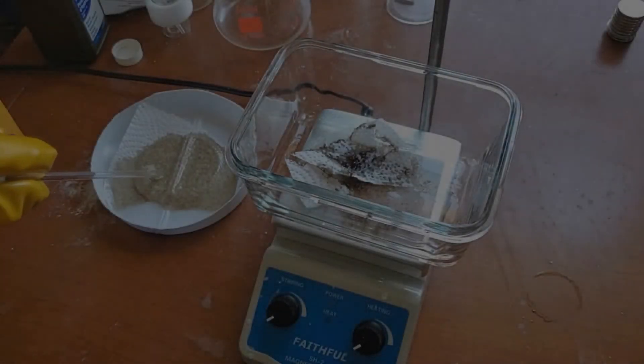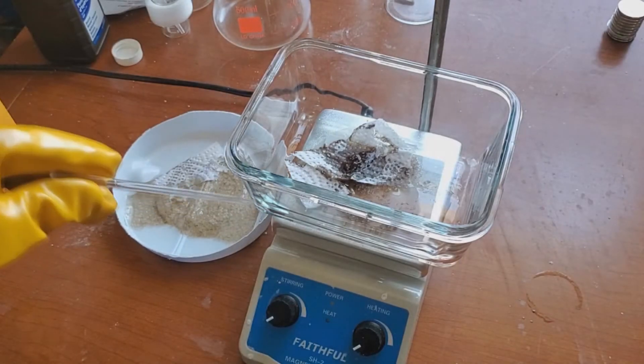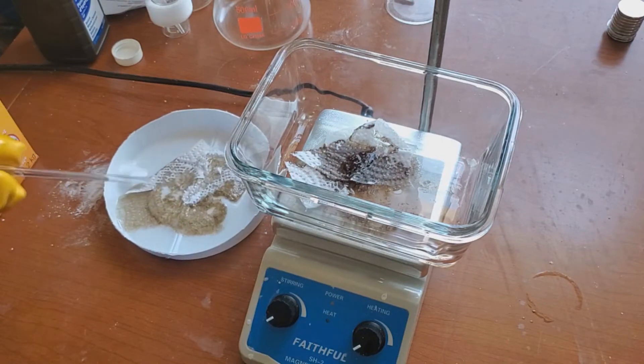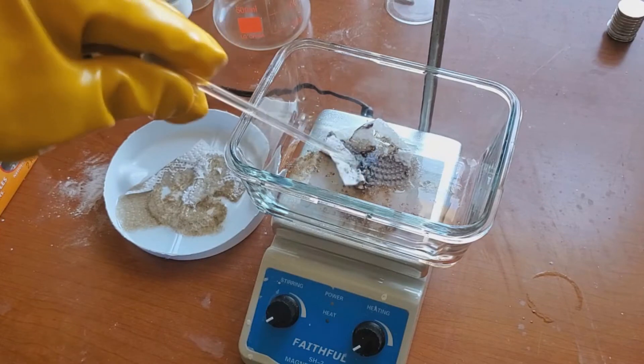Hello, so today we are going to be making diluted piranha solution from sulfuric drain cleaner and 3% hydrogen peroxide. 3%, 6%, 12%, and 30% will all work just fine, just mix them accordingly. 3% is just what I had, so that's what we're going to use.